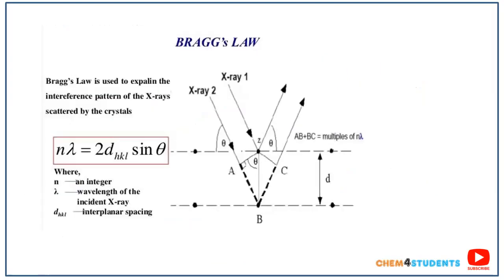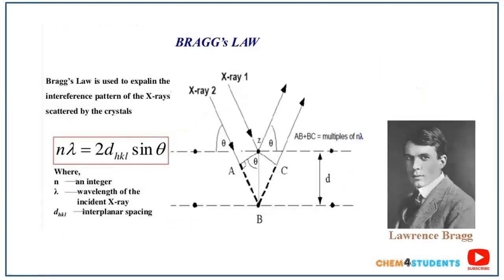How does diffraction happen in a crystal? I will show you how diffraction patterns are formed by crystals. Lawrence Bragg is a physicist who formulated Bragg's law in 1913. What is Bragg's law, and how does it explain diffraction in crystals?